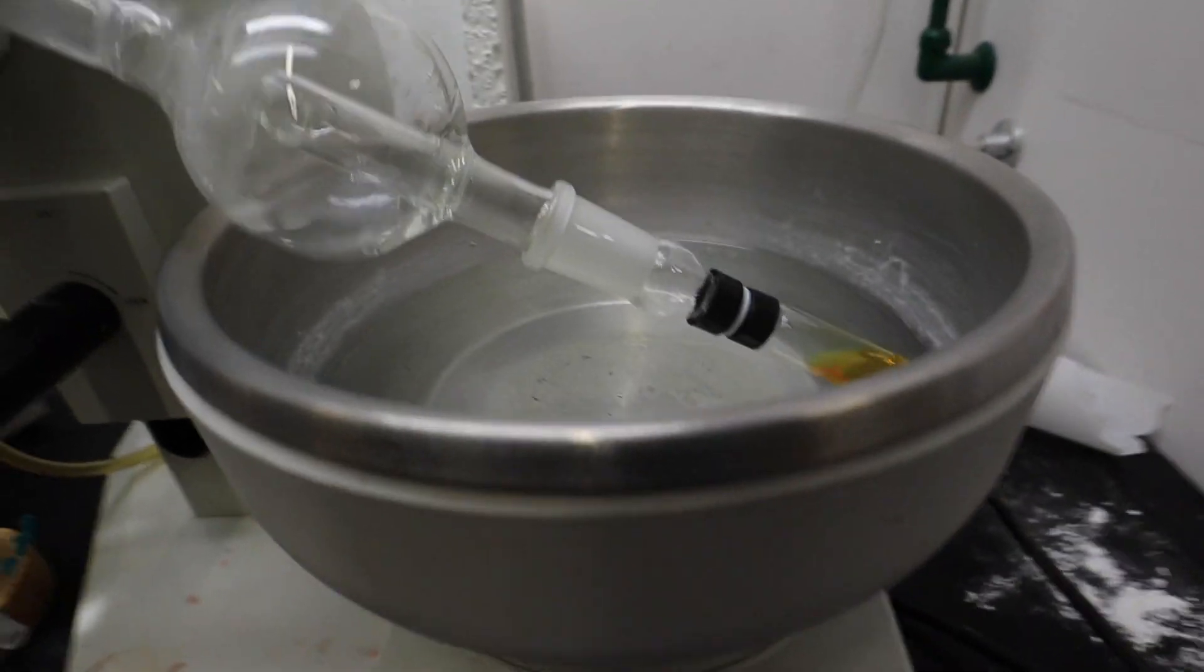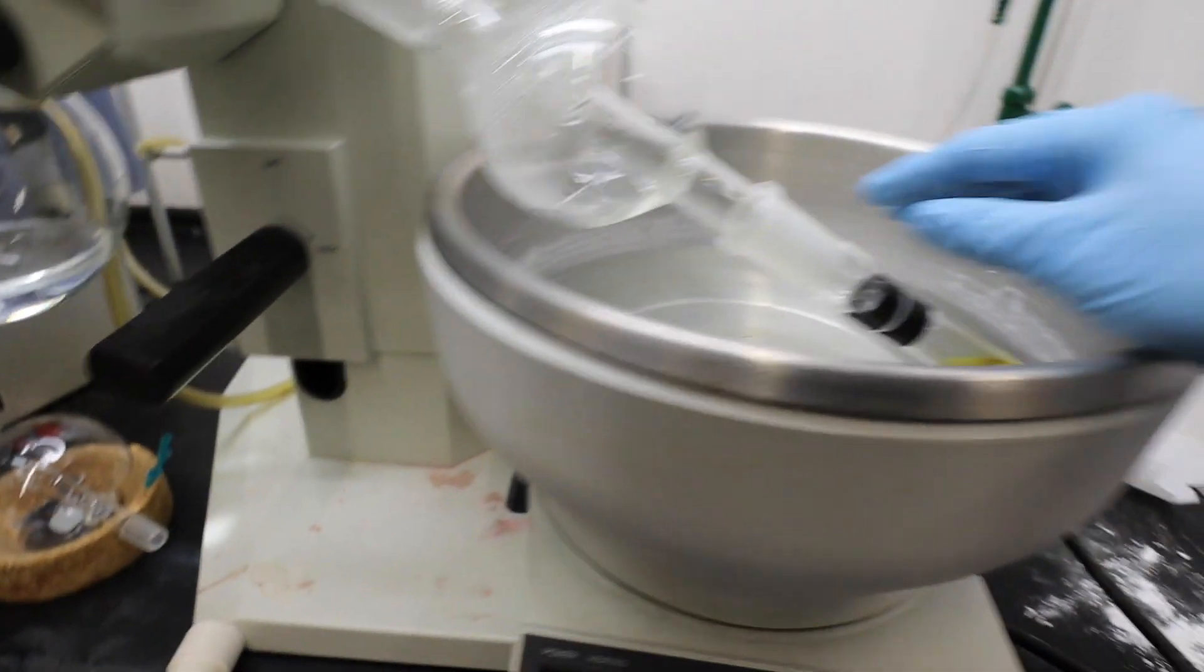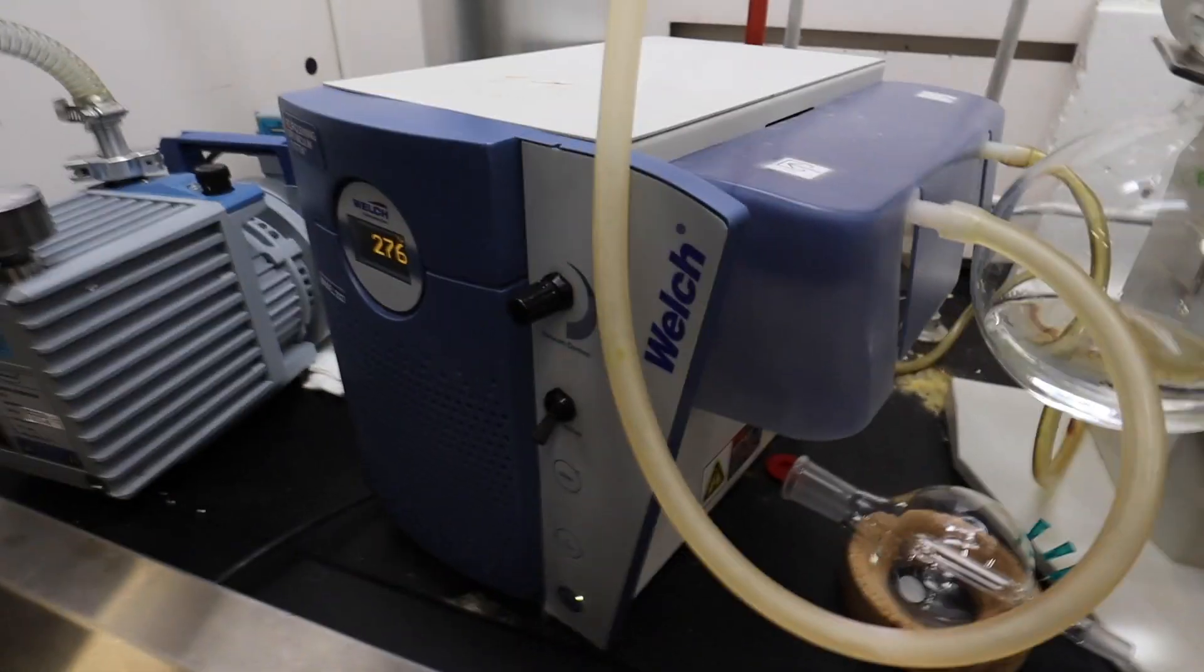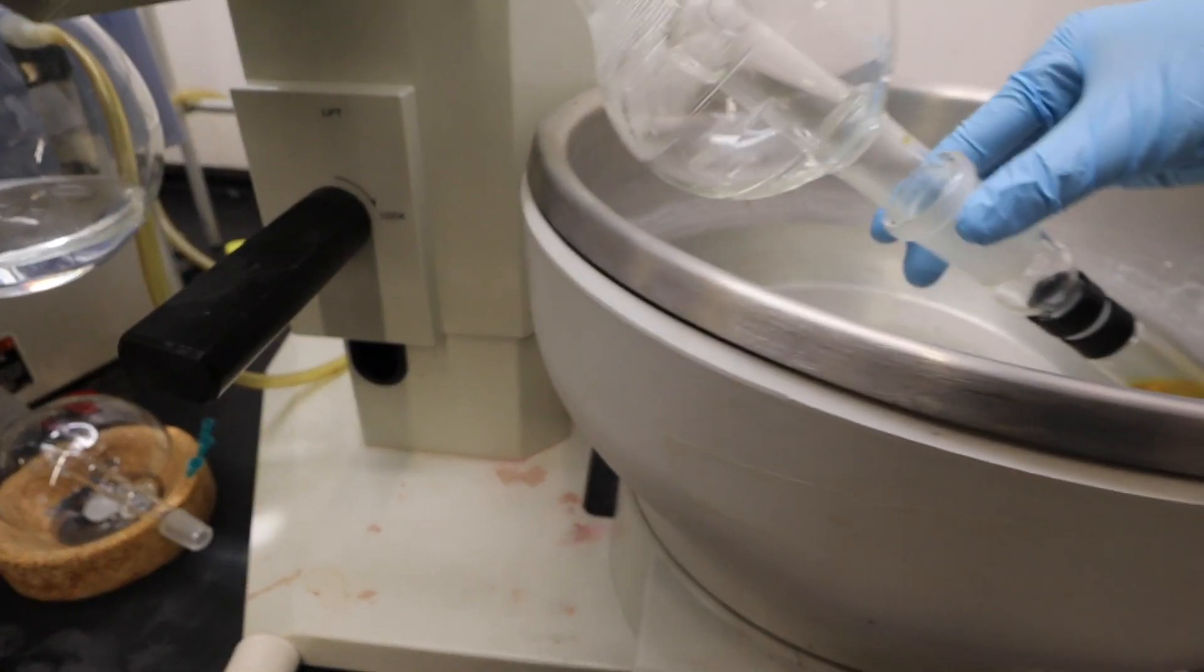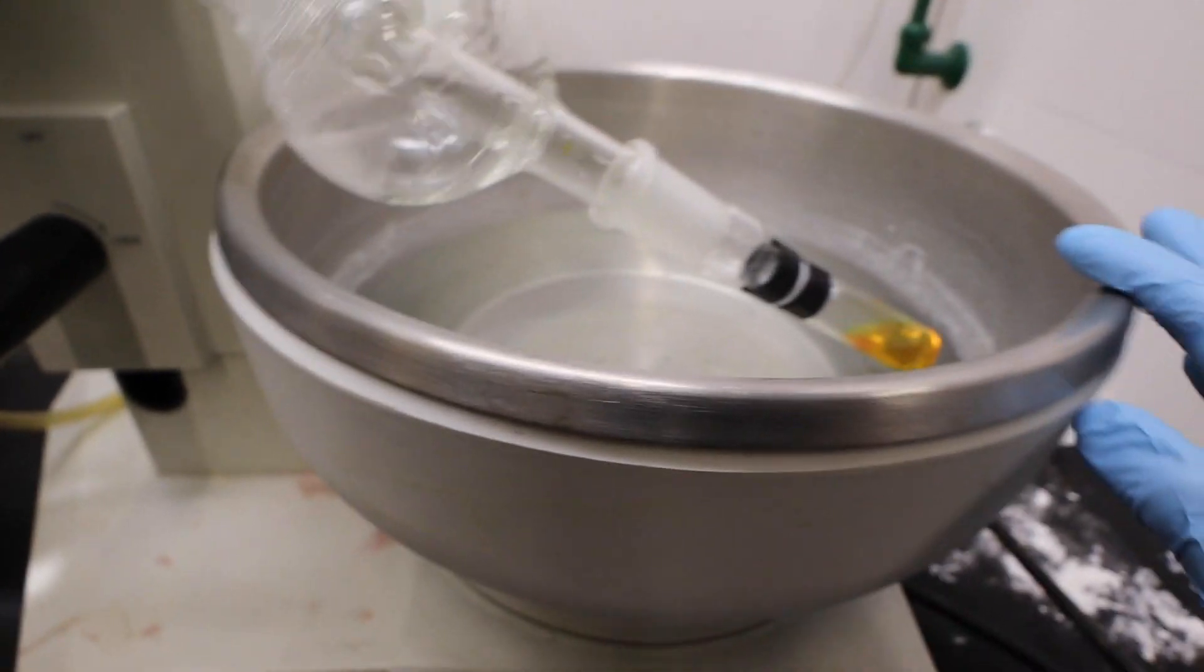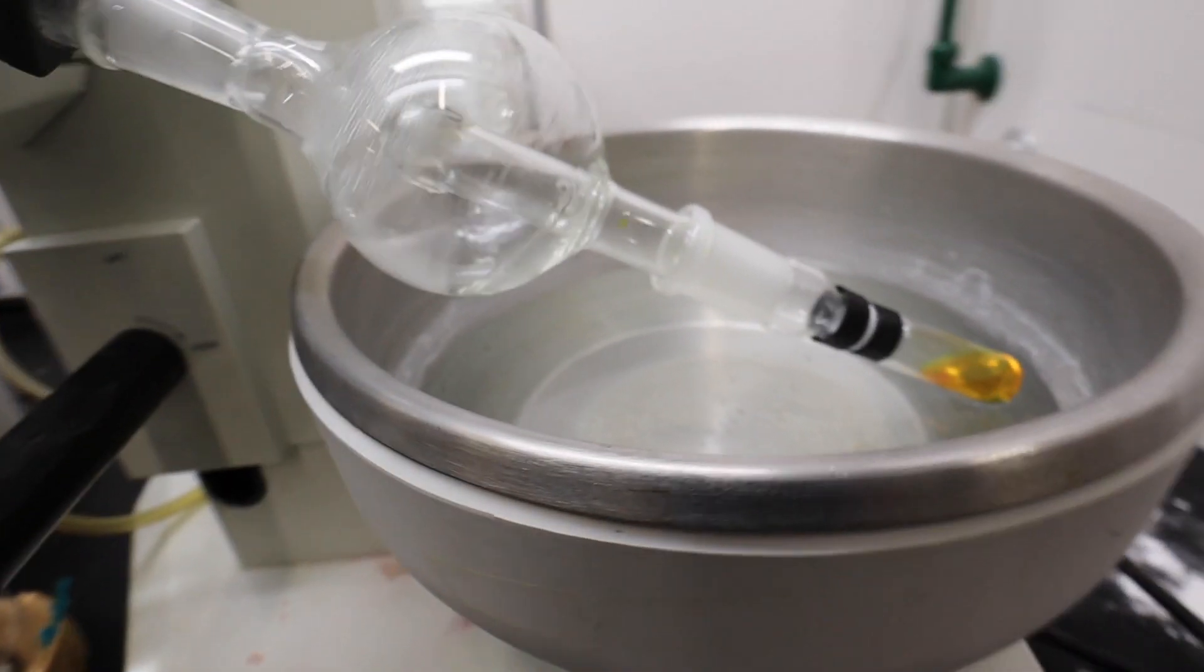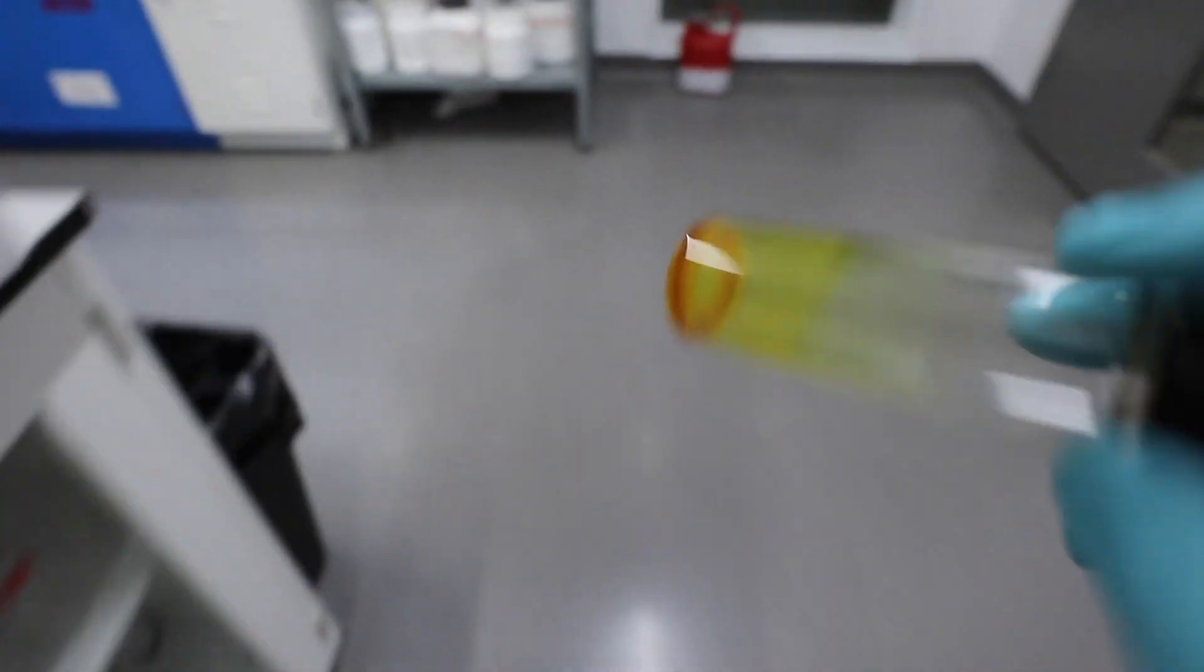Okay, okay, it's all connected now. I get super antsy when I put this on cause like my worst fear is the vacuum breaks here. So when I was putting that on, this fell off, I was like oh no. Yeah, if this is loose then like I'm just scared it'll just fall off and like my sample will fall into the water bath. I'm gonna take my time with this to concentrate it. Let's see how much we got. I have about 200 something milligrams here, so I think that's pretty good.